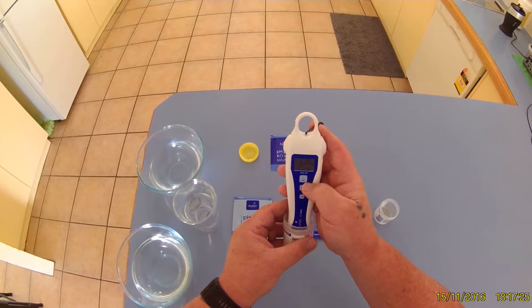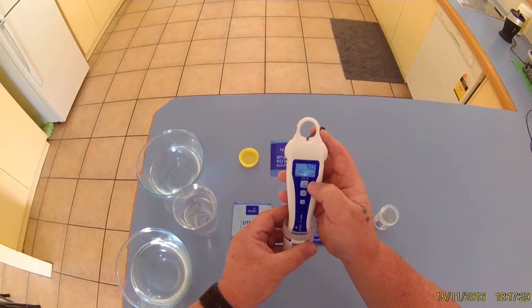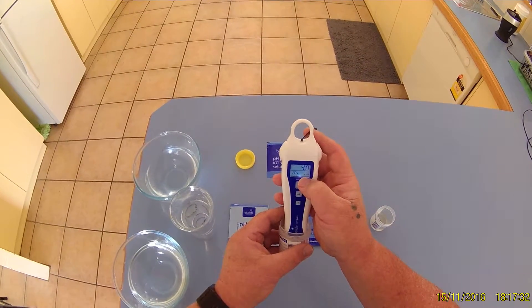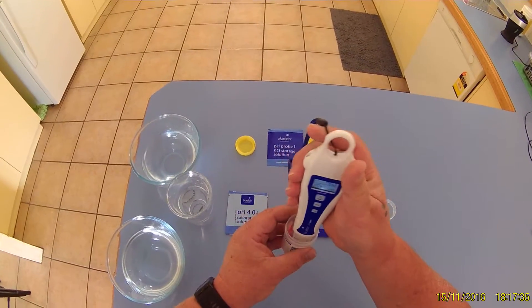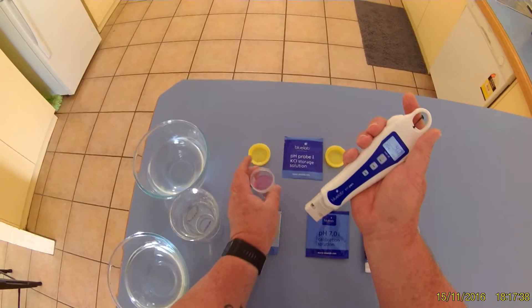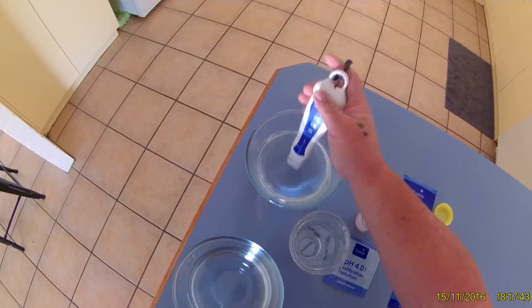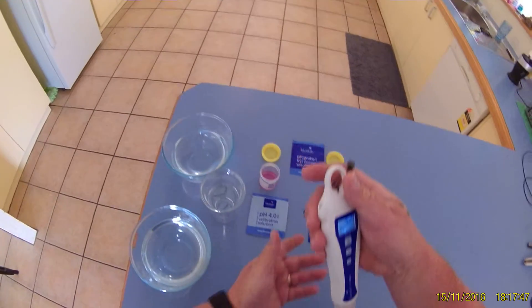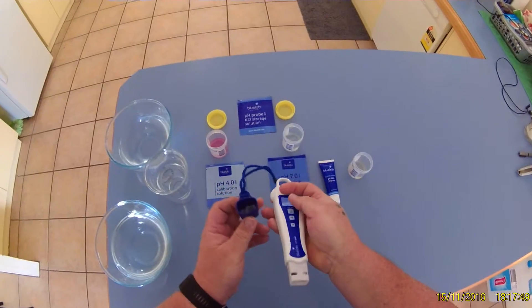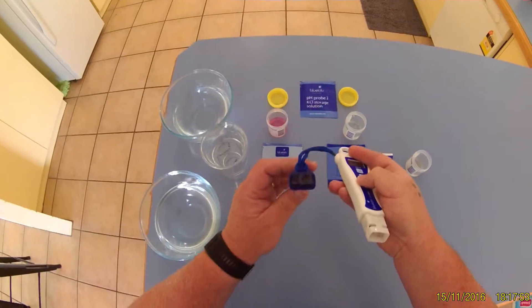That says CAL 4 — it's pretty hard to see without the light on. Now we've got a little tick down there saying that the pen is calibrated. So we'll rinse that out again.